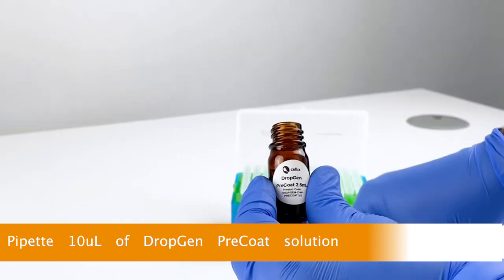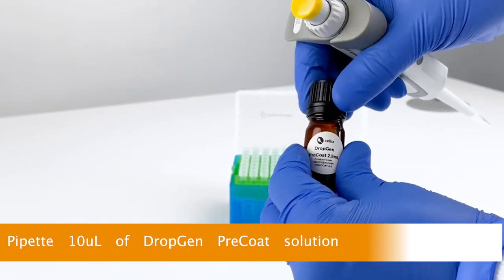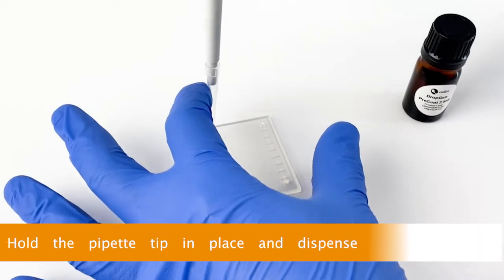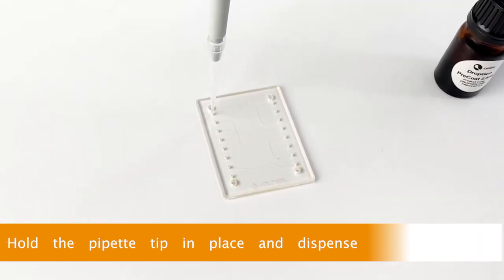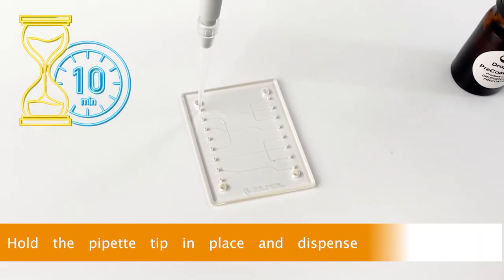Pipette 10 microliters of DropGen pre-coat. Dispense into the input port of the droplet generator as shown. Leave for 10 minutes.